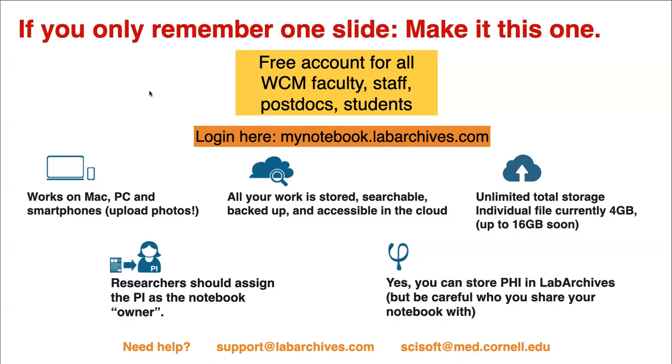Okay, so LabArchives, very importantly, we chose a system that works on Macs, on PC, on Linux. It's completely cloud-based. And very useful, it also works on smartphones and on iPads, both iPhone and Android, to type entries.